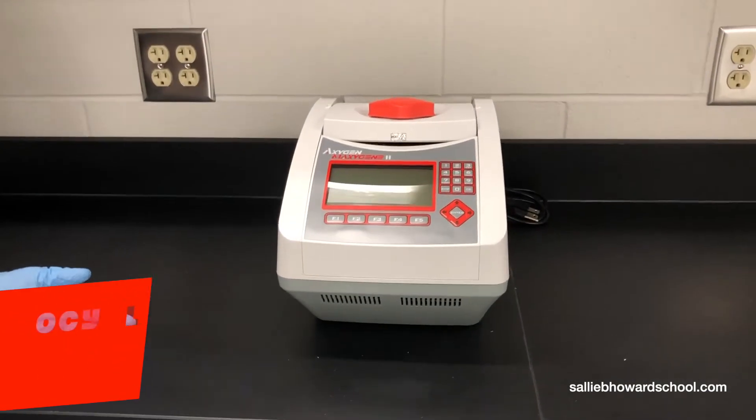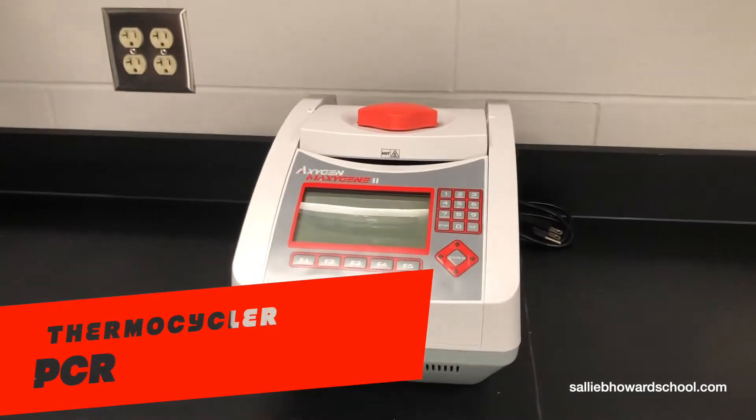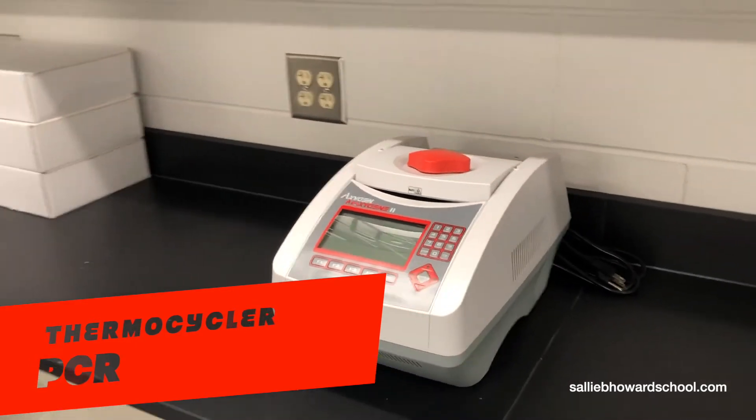This little instrument is called a thermocycler, also known as PCR. It typically takes DNA and amplifies it, and what we mean by that is it makes many copies of DNA for use in testing.